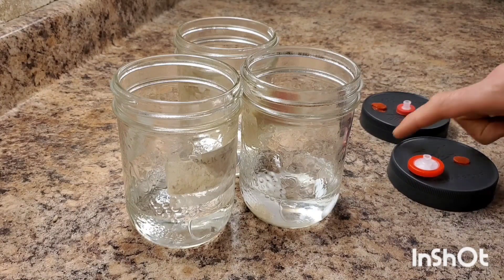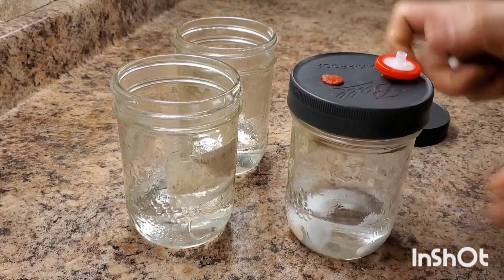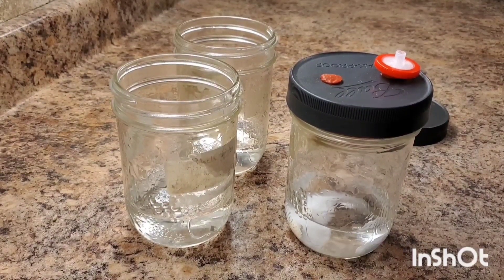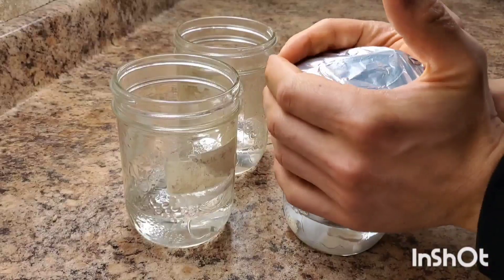So let's cover the jar and put our little tinfoil hat on top. Now we're ready for the pressure cook.